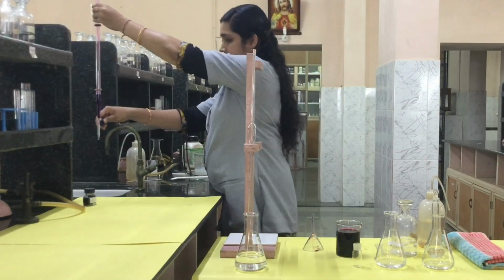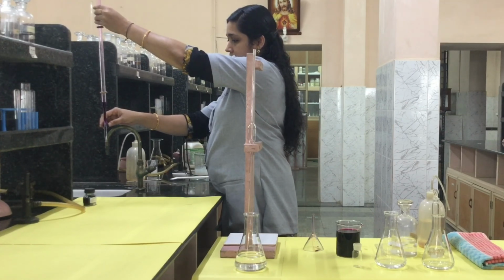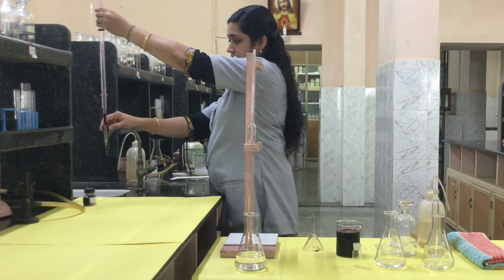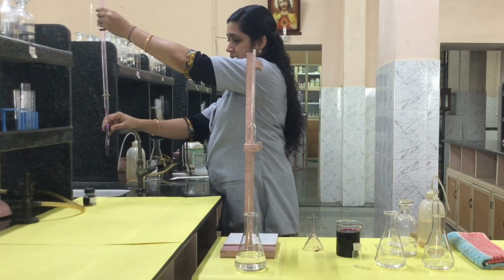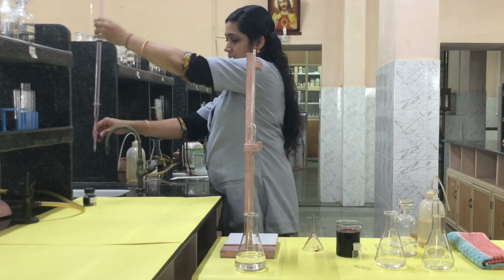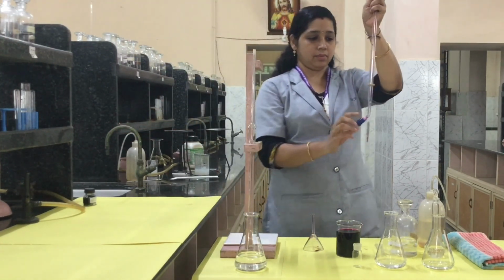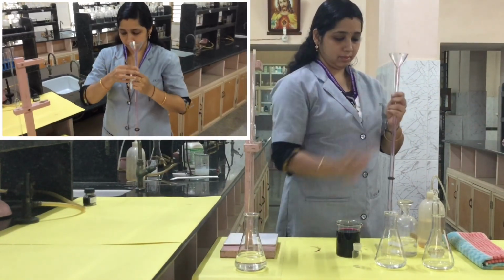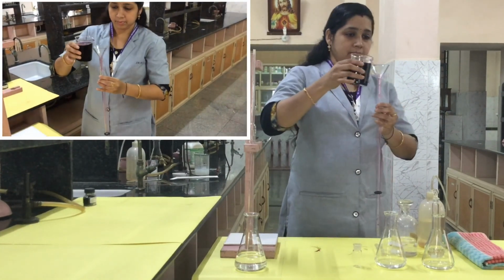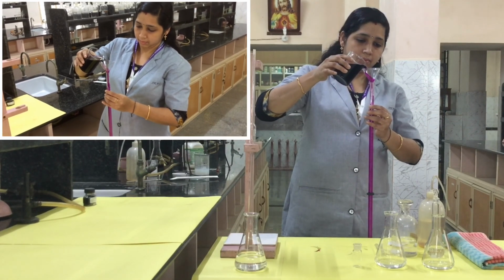Now just remove this KMnO4 from the burette. You can see the nozzle also. Through the nozzle, you just remove the KMnO4. Okay. Now we can fill this burette with KMnO4. Tighten this burette, then using this funnel, we fill the KMnO4 into the burette.